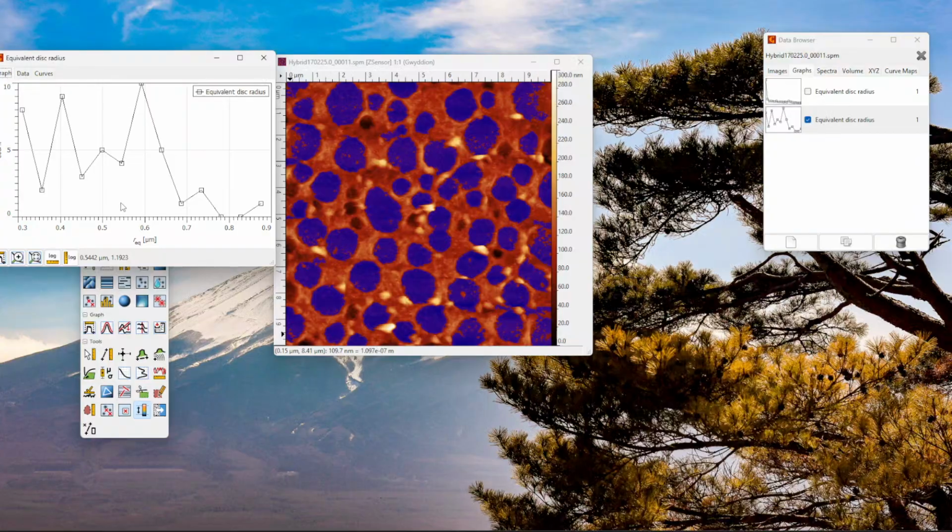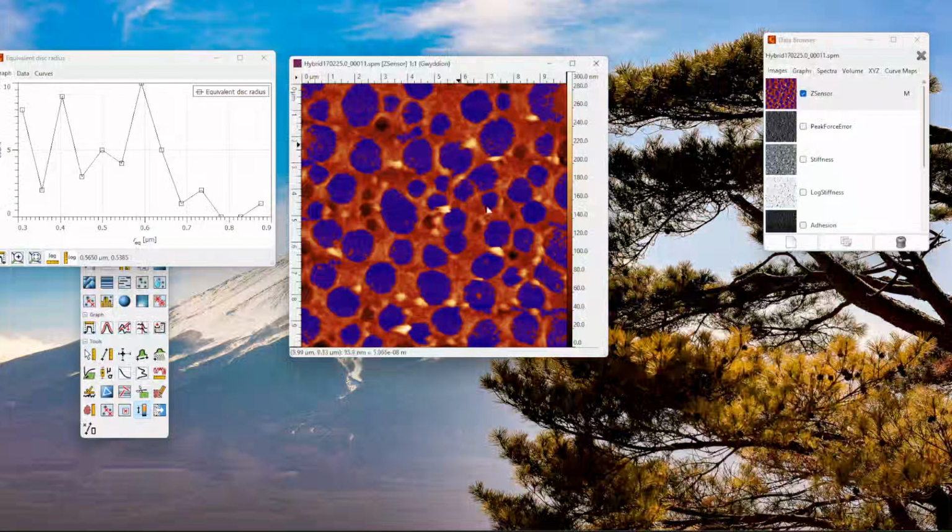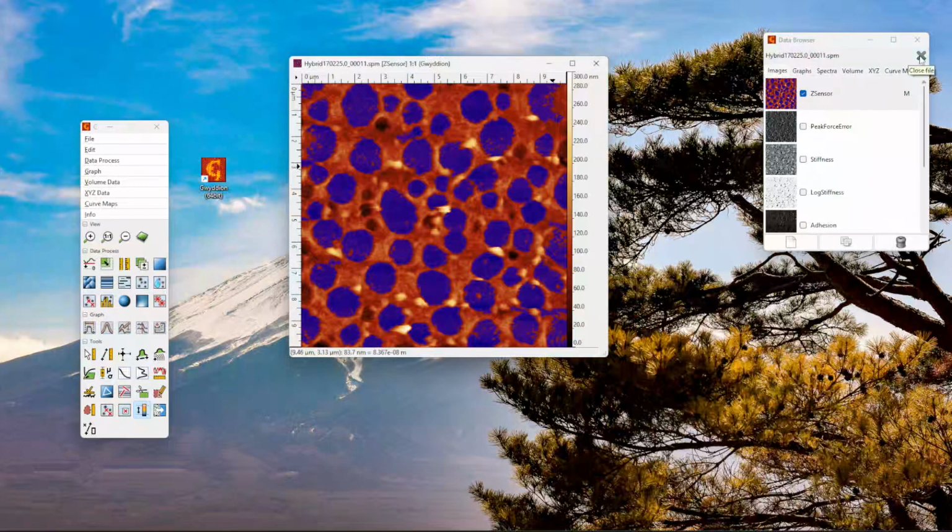So that's pretty much it. Once you have it in your image, you can save it or whatever is also in here. Graphs, you can do extract to new file and so on. So it's pretty easy, and you can basically compare it across different images.